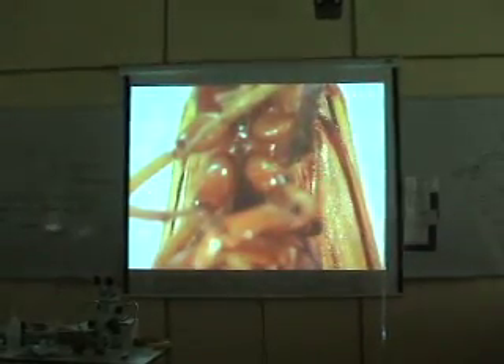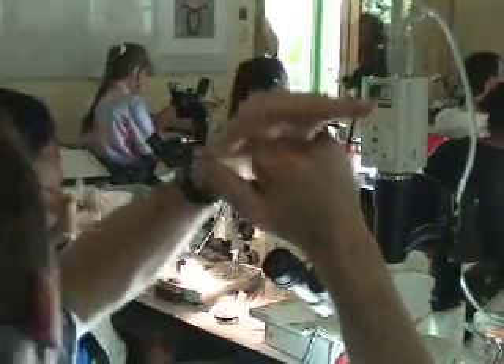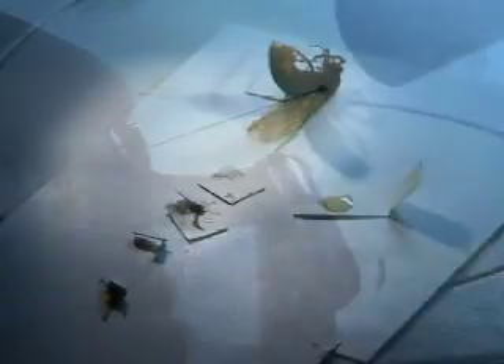We ant people are funny folk, and we even point-mount big ants like this male Lasius. What I'll often do with a big ant like this is make a platform for the point to sit on. If I put the point on the venter, coming in from the left side because I'm left-handed, I pre-make a little platform of cardboard so the left extremity of the point sits on it. Until the glue is hard, it'll just stay there and won't droop down on the specimen. I squirted glue onto this piece of cardboard about two minutes ago and it's now about the right consistency for a large ant. In dry conditions, let it sit for 10 minutes; under humid conditions, leave the point without a pin through it for as long as 12 hours.